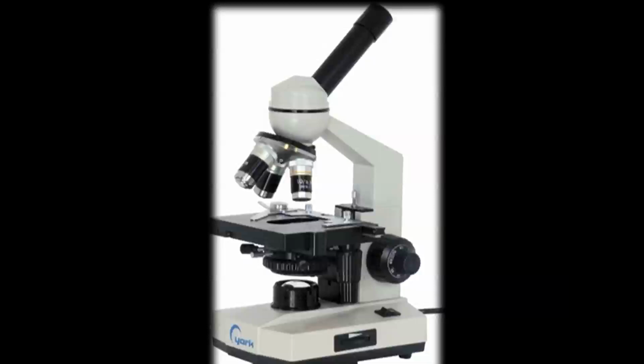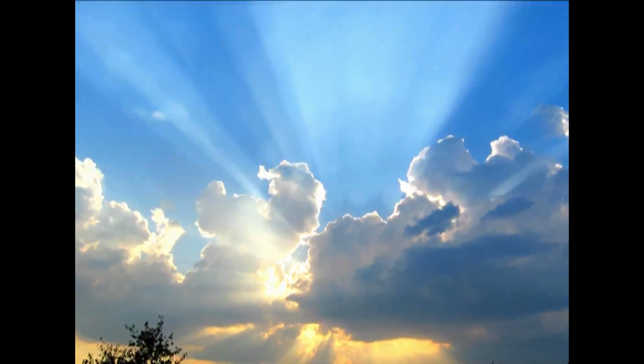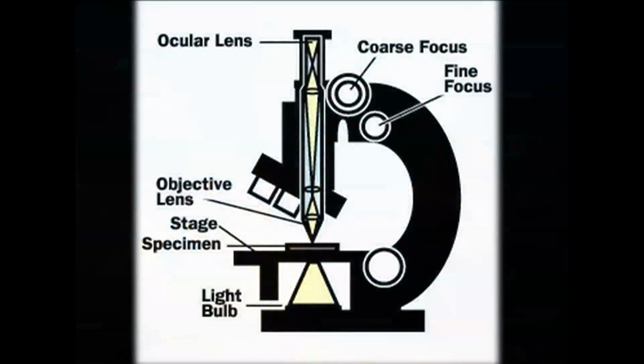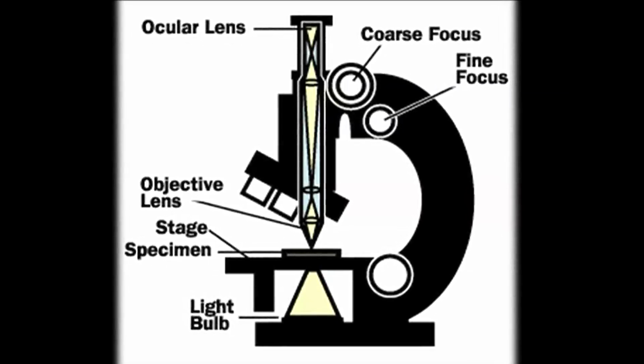Welcome viewers to this course on microscopy, where I will introduce you to different aspects of the microscope as well as different properties of light. Now, before coming to light, I should tell you that in a microscope, the source of illumination can vary from visible light to electrons.